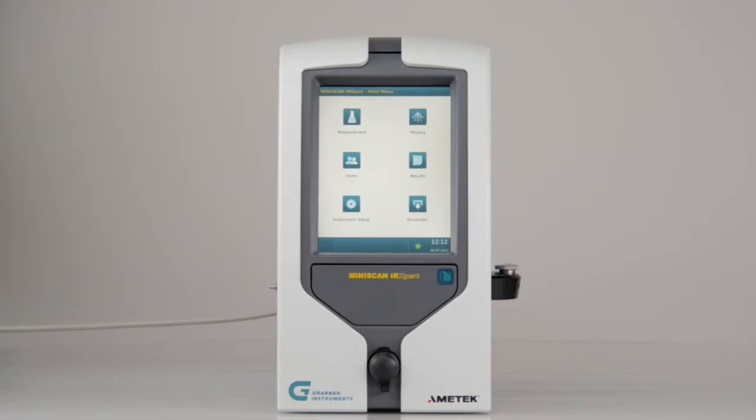If you turn off the analyzer, please use the shutdown button to protect the integrity of your data.